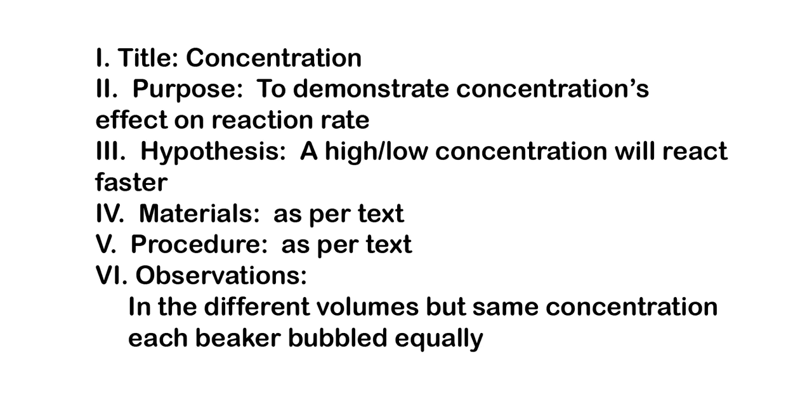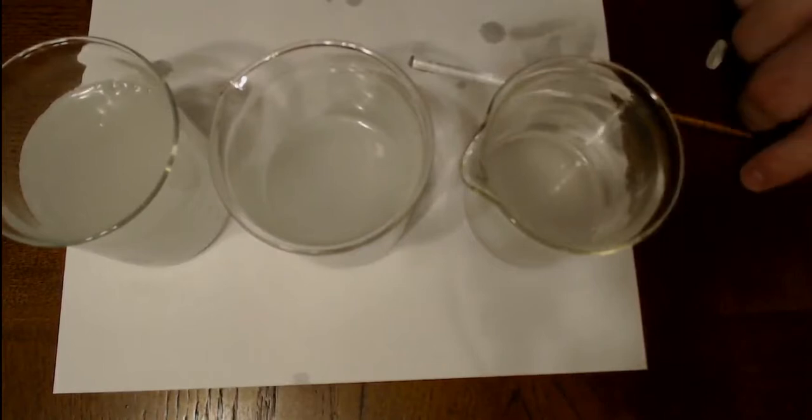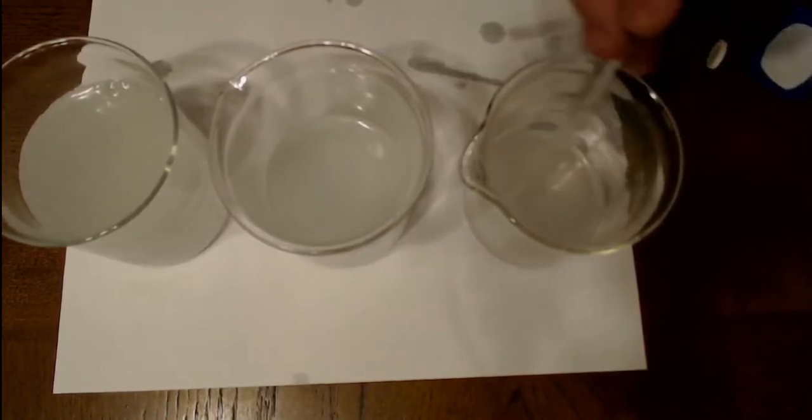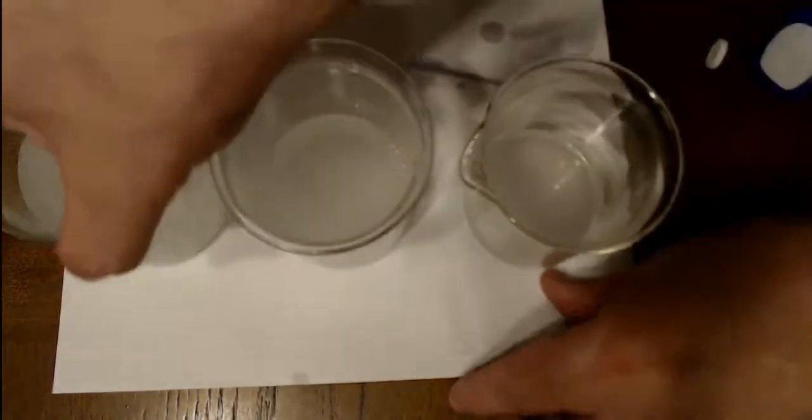Okay, let's go back, take a look at our bubbling. So everything's clouding up, so it's harder to see the bubbling. But yep, everything's still going. This one's going pretty good. Yeah, it's all clouding up, hard to see on the video. I wonder if it'll look better without. I put the white under thinking that that might help, but what happens if we get rid of the white?